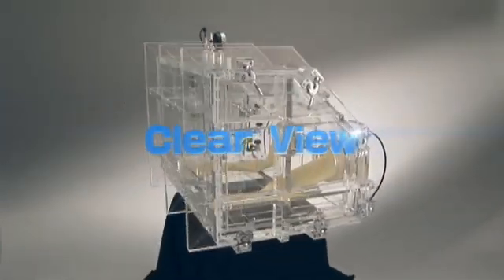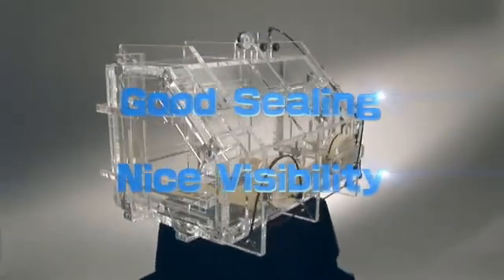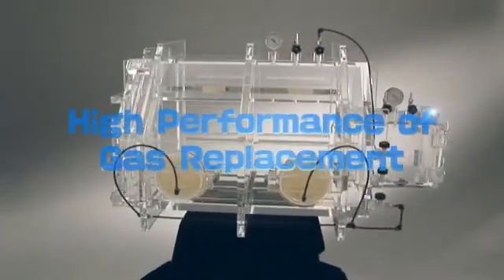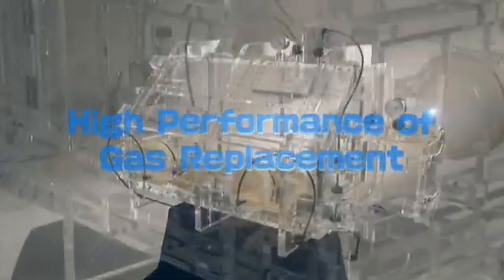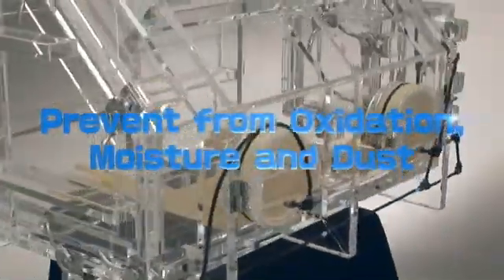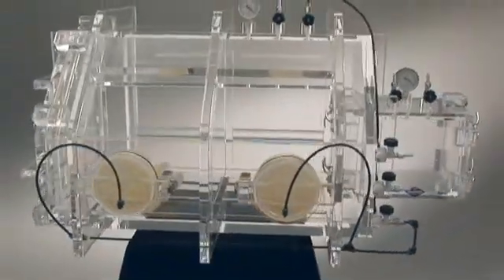All sides are clear and have good sealing and nice visibility. It can create a vacuum environment and has high performance of gas replacement. It supports steady operation under an environment without external factors such as oxidation, moisture, and dust.